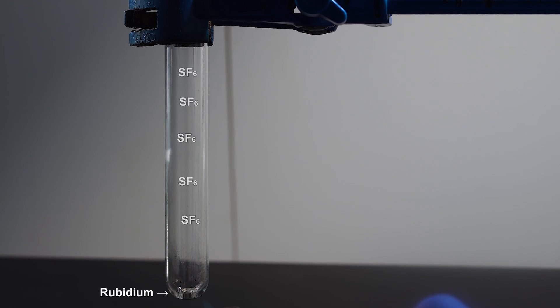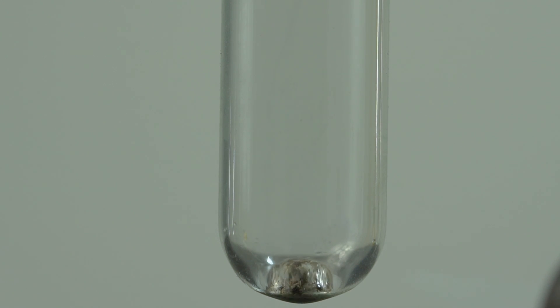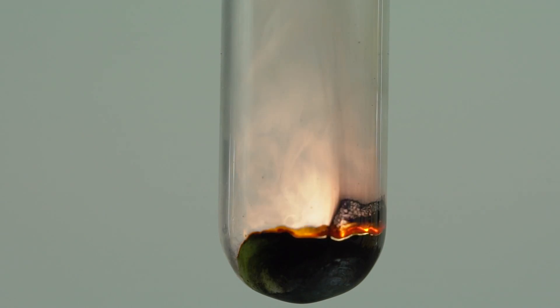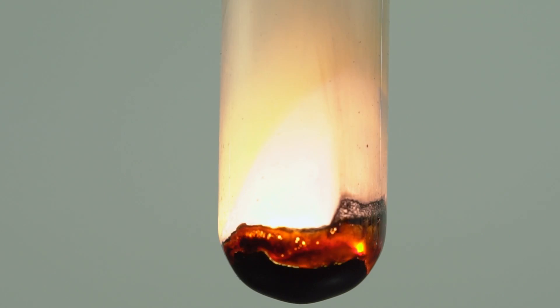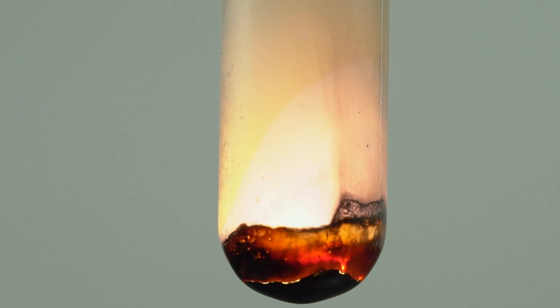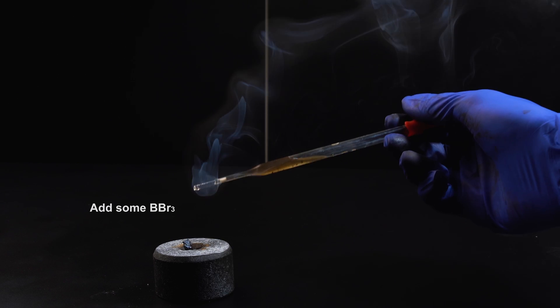Now I'll try to heat up a piece of metal rubidium in a sulfur hexafluoride atmosphere. Here you can see the formation of a yellow hint of elemental sulfur during the reaction. As well as other alkali metals, rubidium explodes on impact too, if boron tribromide is dribbled on it beforehand.